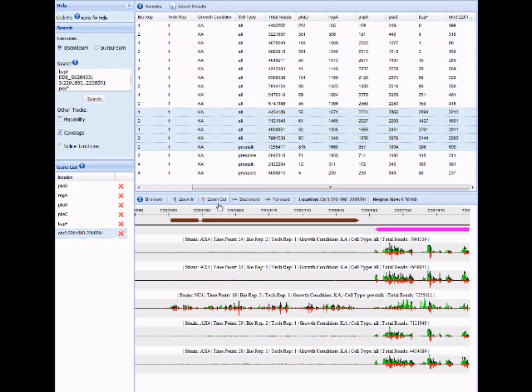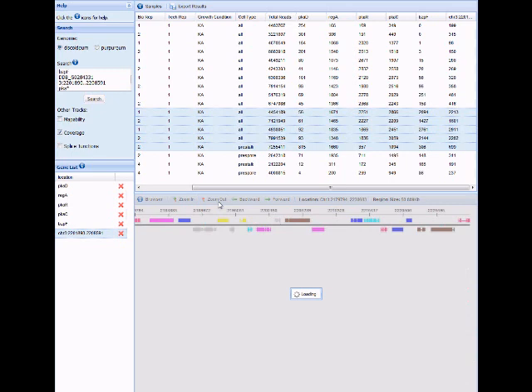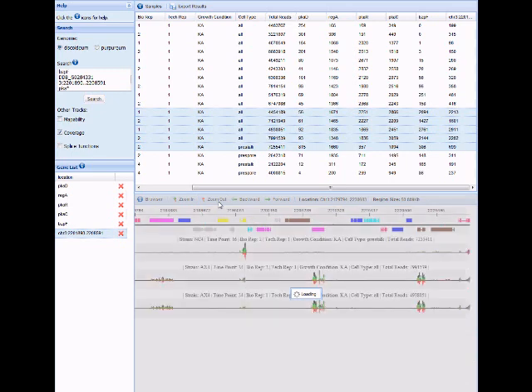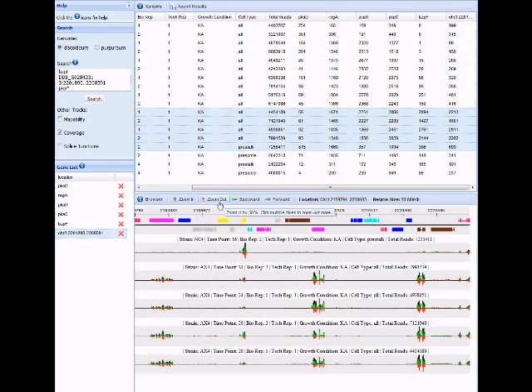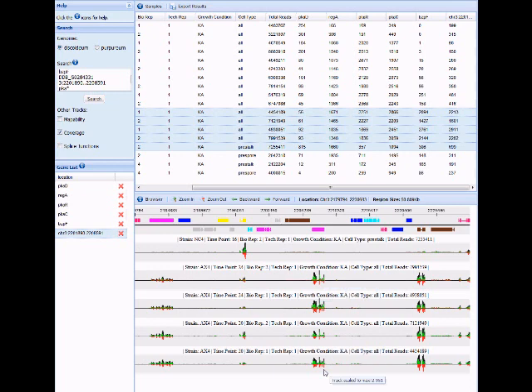If you wanted to zoom out a lot, you just click the Zoom Out button a couple of times. You notice that the region size changes as you click the button multiple times. Now you've zoomed out 2 or 3x, and now you're seeing many more gene models and the read coverage from the tracks that you had previously selected.